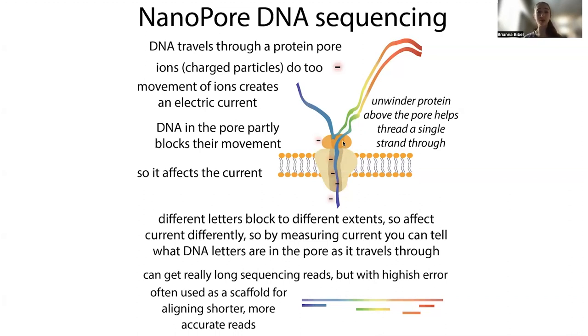This is also useful for RNA, and for finding modifications in DNA, because all of this stuff can influence how the current flows through.